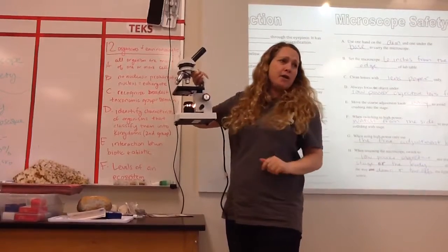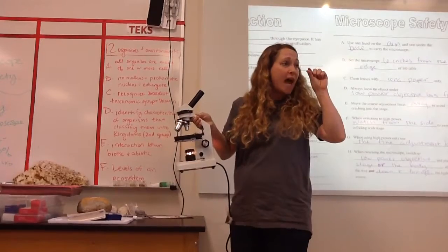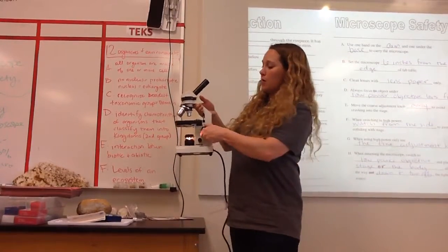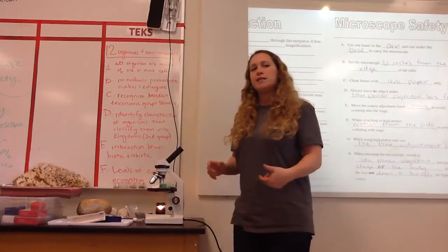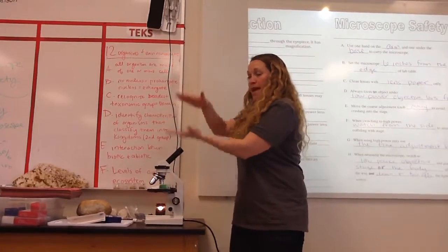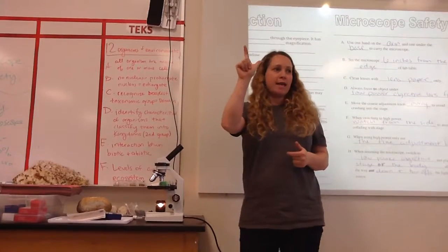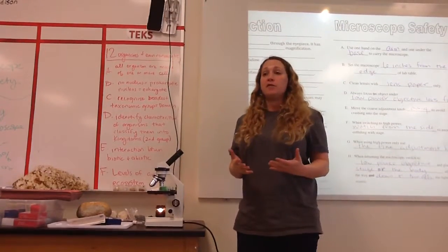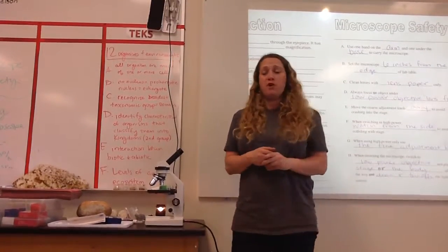It may not seem like much, but it doesn't need to be much because we are on the microscopic level, super tiny. So to change the focus, you only have to move a tiny bit, okay? So it needs to start all the way raised. You'll notice I didn't raise it with my eye on the eyepiece because when you raise it, it can hit the objective lens and that can break the lens, it can break the glass, and it usually always breaks the slide. We only have a limited number of slides. If you break them, your group just might not have one. So please be very careful.